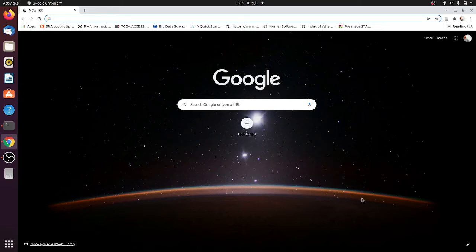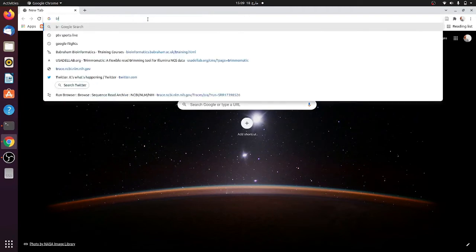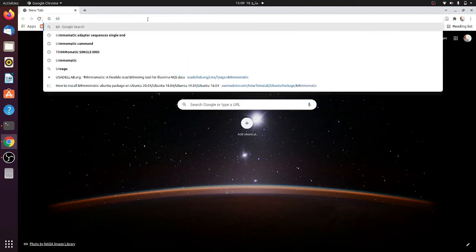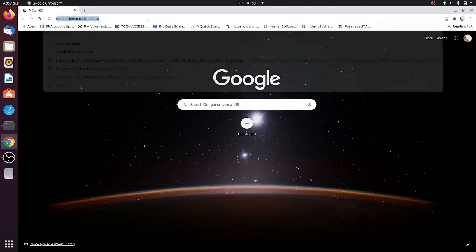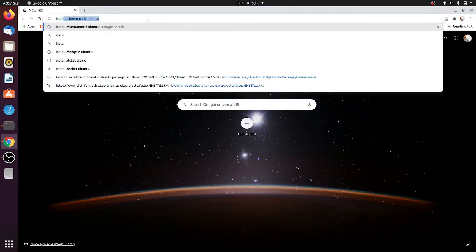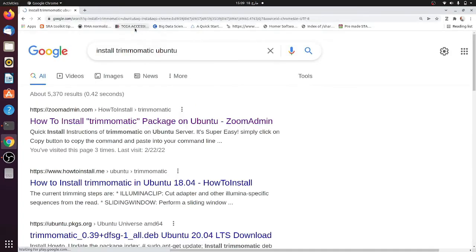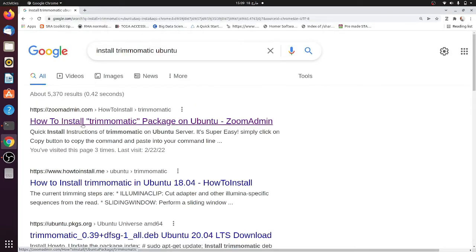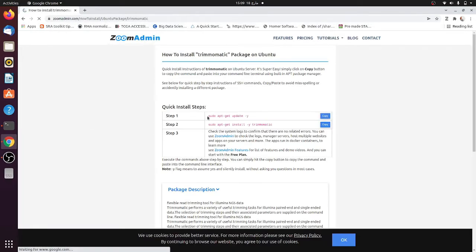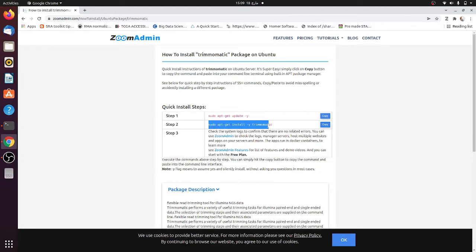For that, what you need to do is install Trimmomatic. If you write install Trimmomatic command, how to install Trimmomatic, when you click it you can see the three steps. You can just write this command here and it will automatically install Trimmomatic.